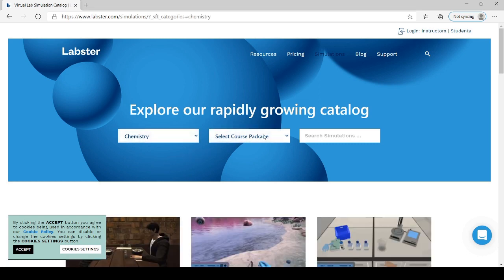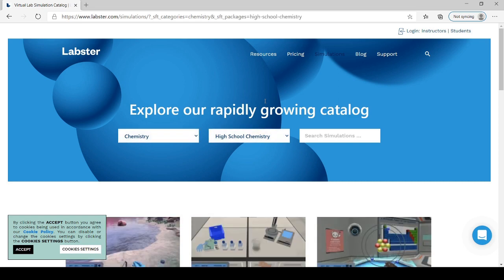In chemistry we have different types of options available, like high school chemistry, introduction to chemistry, organic and biological chemistry, general chemistry 1 and 2. Based on my class, I am looking for high school chemistry, so I will click on high school chemistry itself.